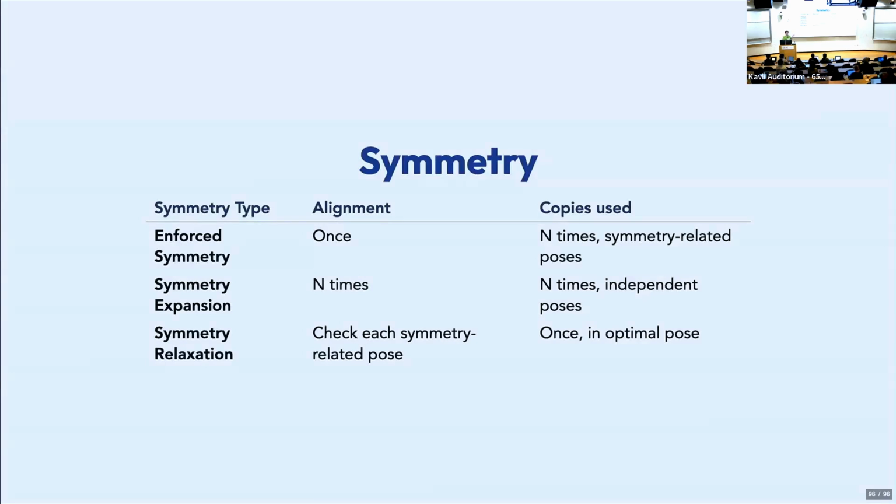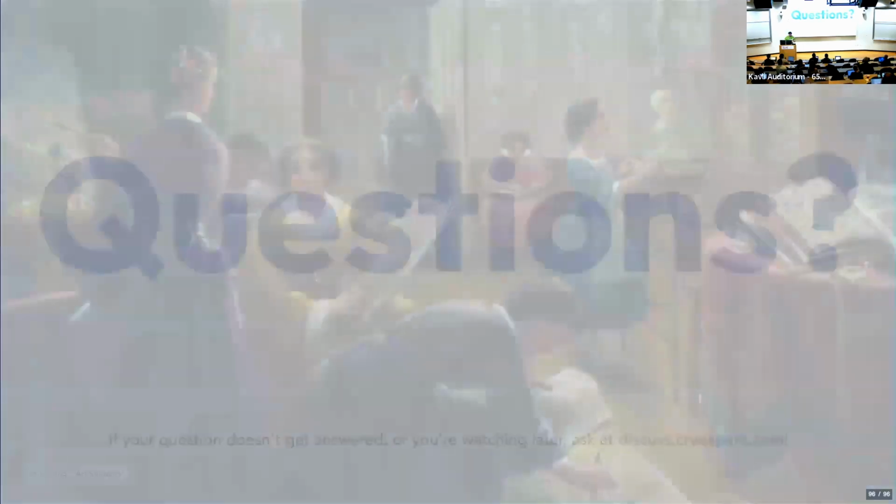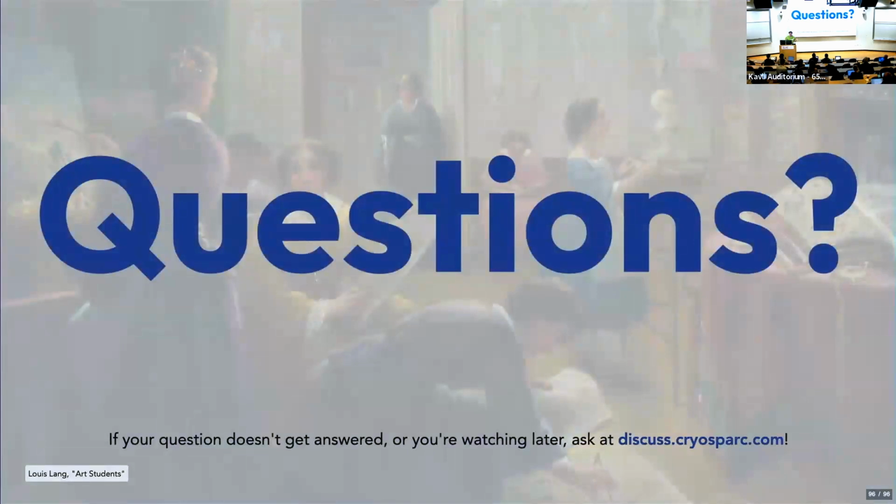And I forgot to say that. That's the big advantage of using symmetry, is that a single image, in this case, it was 4-fold symmetric, right? Because we could use that single image in 4 different poses, we basically got to use it 4 times. So you really increase your signal-to-noise ratio when you have a symmetric particle. Okay? That is the end of the fundamentals part.